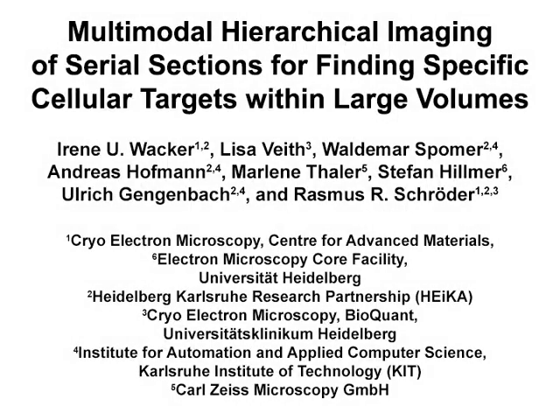The overall goal of this workflow is to identify certain targets for ultrastructural imaging within a tissue using light microscopy, followed by 3D imaging in an SEM at very high resolution. The imaging workflow introduced here can help answer key questions about cellular or tissue ultrastructure in a number of fields such as cell biology, developmental biology, neuroscience, or even pathology.